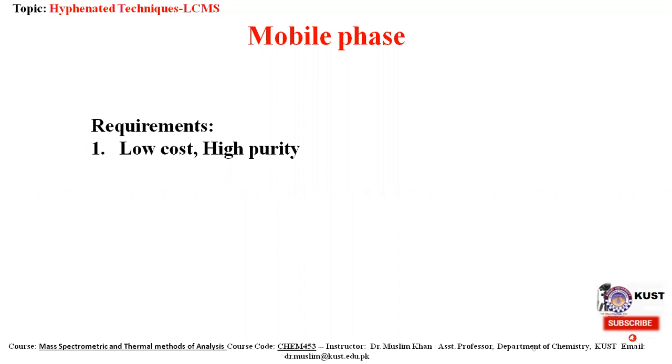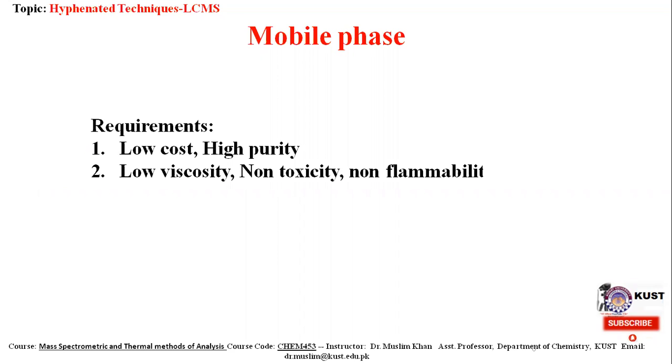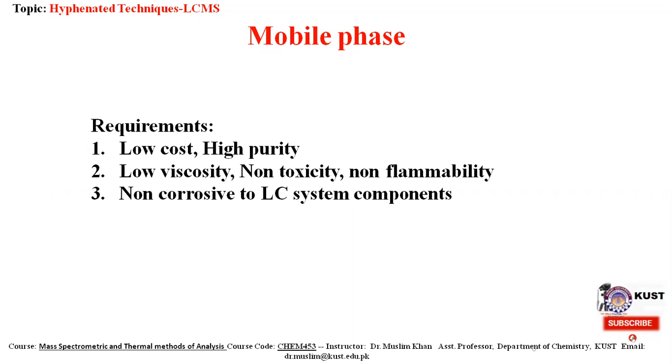Mobile phase is one of the key components of HPLC. It must be low cost, having high purity, low viscosity, non-toxic and non-flammable. Also, it must be non-corrosive to LC system components.